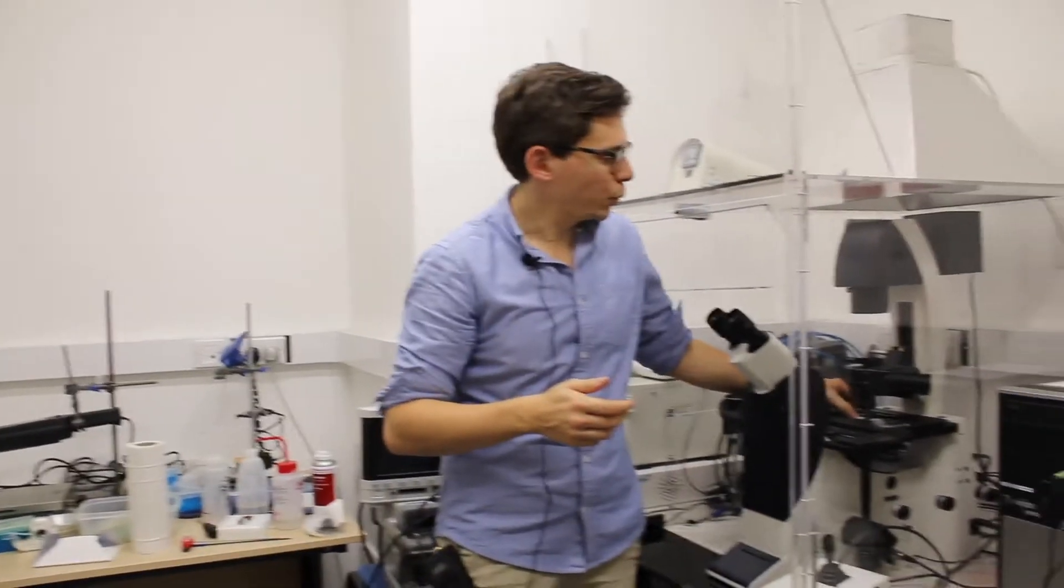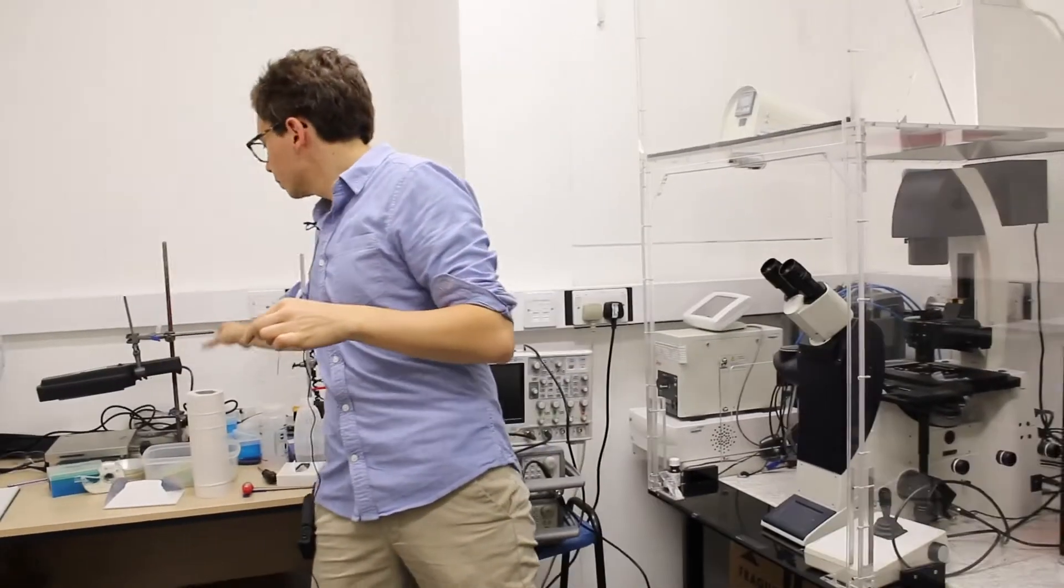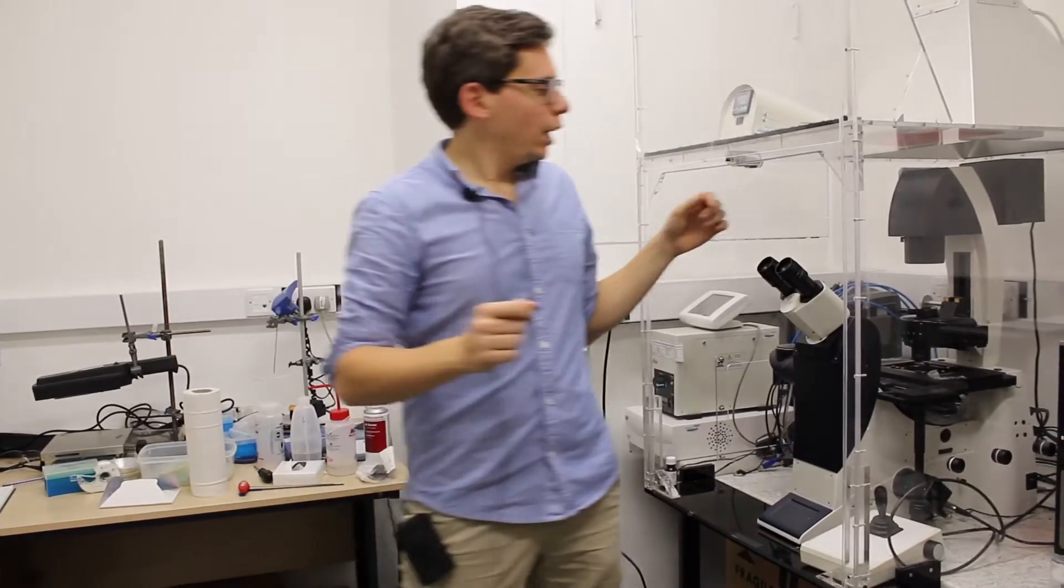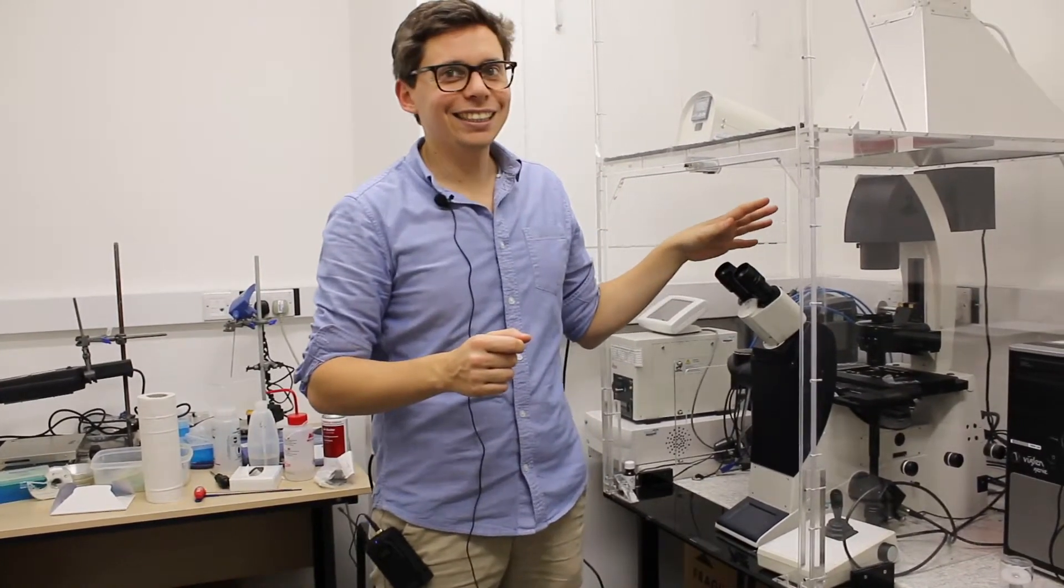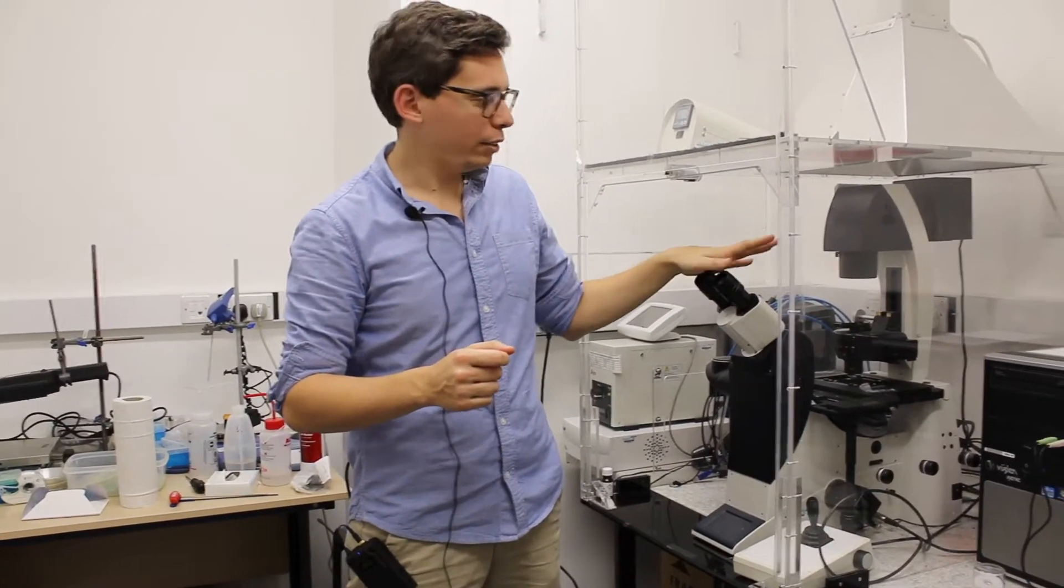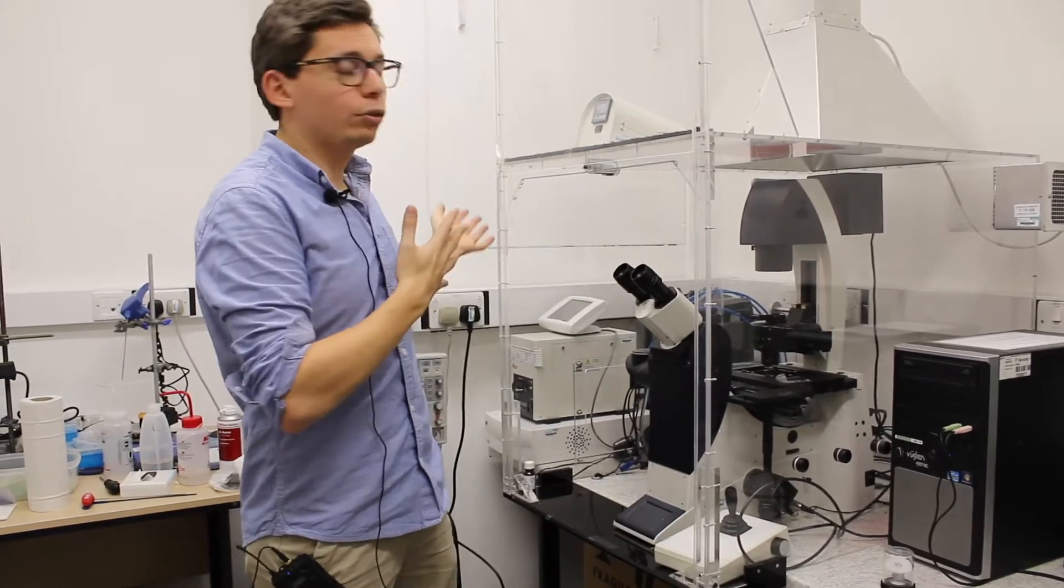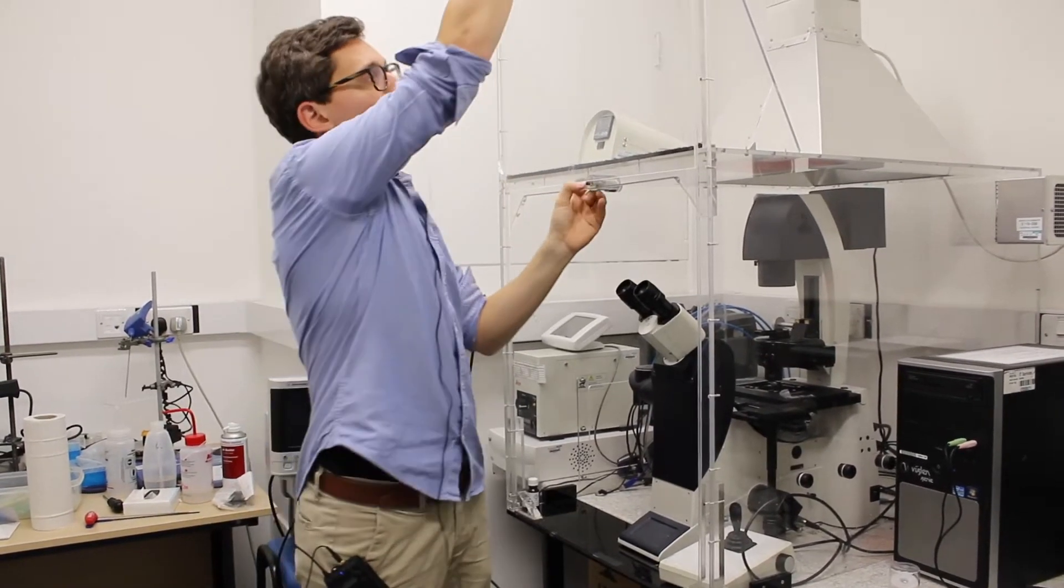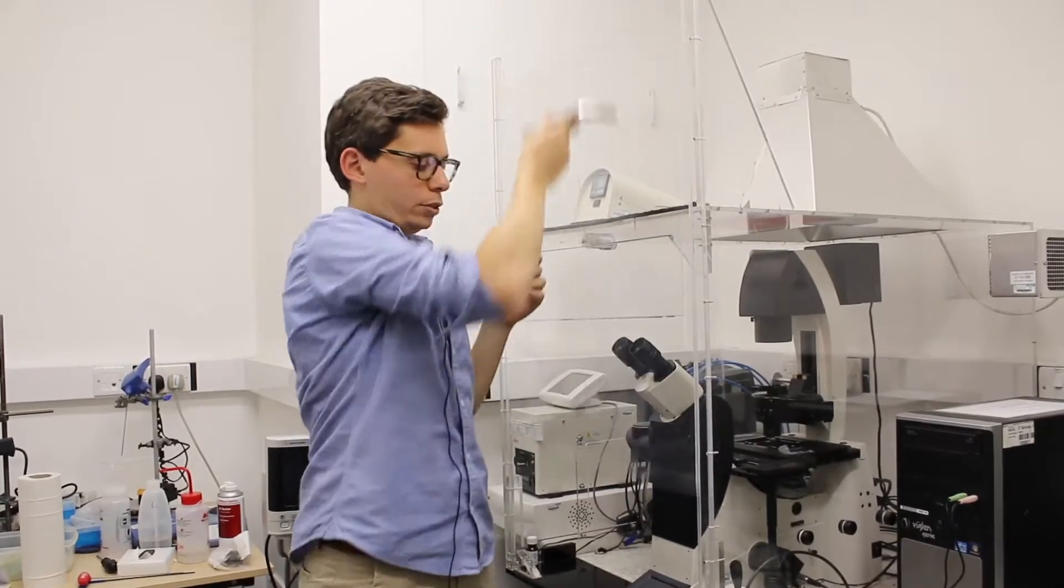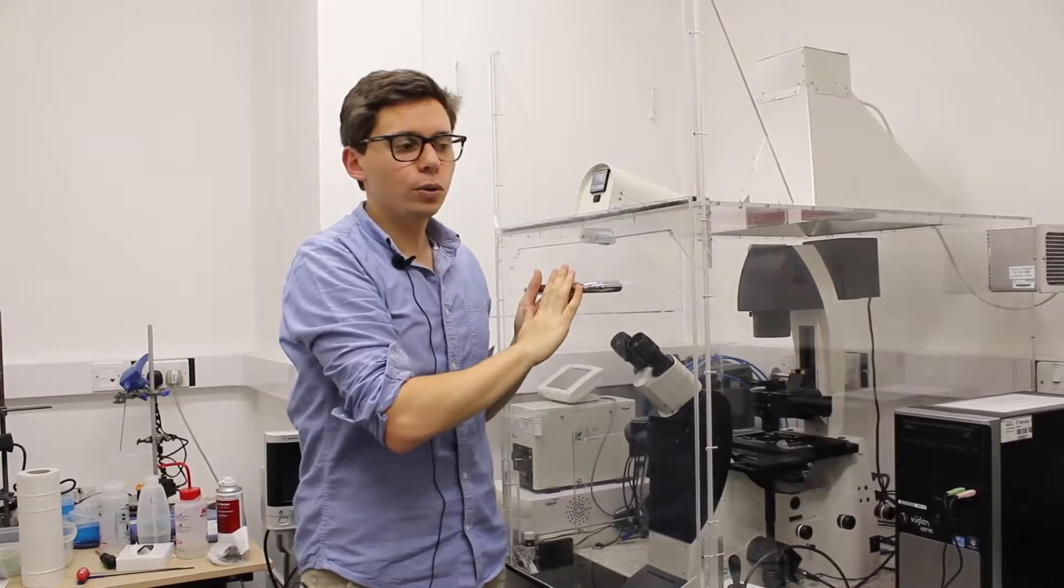So when you're done using the microscope, you should remember to do a few things before you leave. First thing, remove your sample. Throw it away. Then you turn off the brightfield lamp. And then you turn off or not the fluorescence lamp. You close the dust free box, so it stays closed.